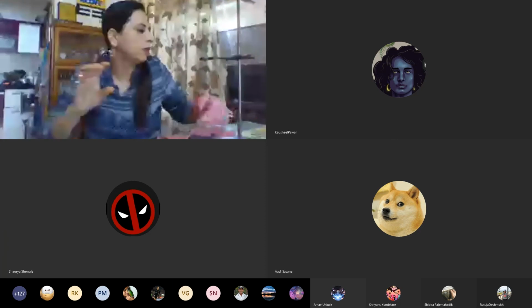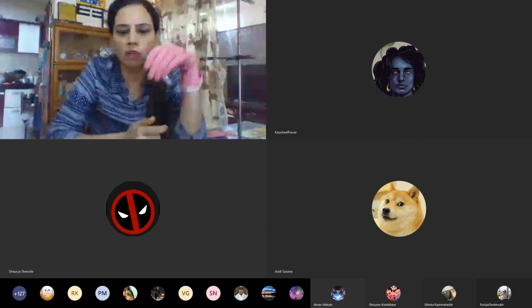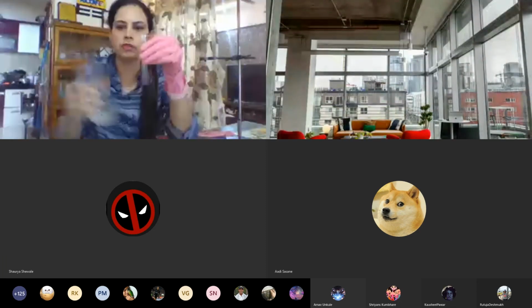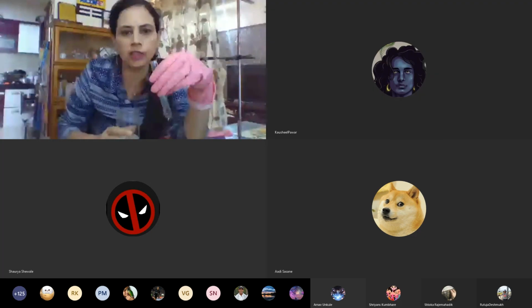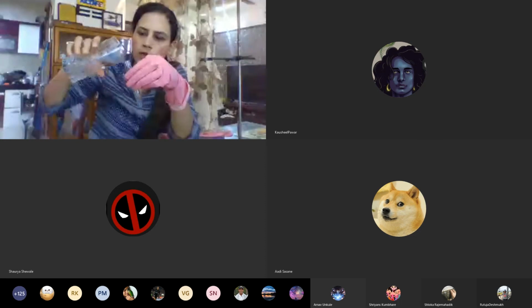Okay, next we will see reaction of sulfur with water. Right now in my test tube, Arnav Bavankar, can you switch off your video because it is distracting me? So I'm going to add some water here.